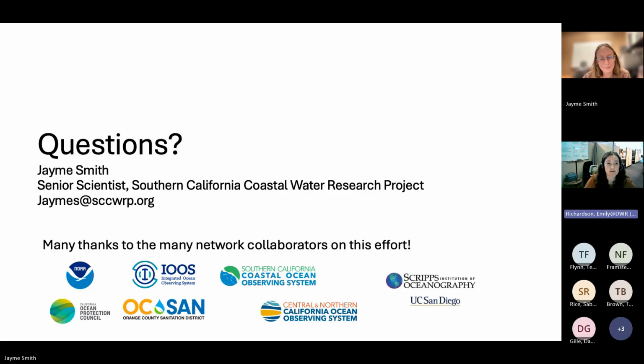You had mentioned a multi-day training course. Is that something that the manufacturer puts on? Yes, they provide it. This is an instrument that's built by McLane. I should have said that. They provide really great support. For example, I've been on Zoom with Tom many times, saying I need to replace this part and I forgot how to do this. They say, okay, take your screwdriver, go right there, turn the camera so I can see what you're doing. They're in Massachusetts, so it's just the time difference. But they're great, and they provide a ton of support, well after you purchase the instrument.